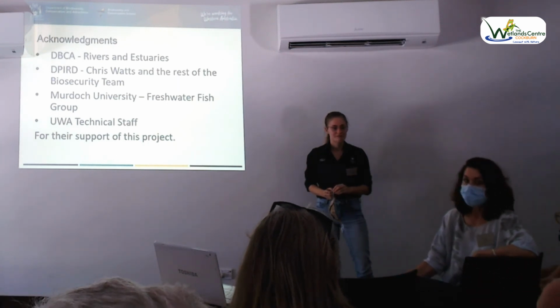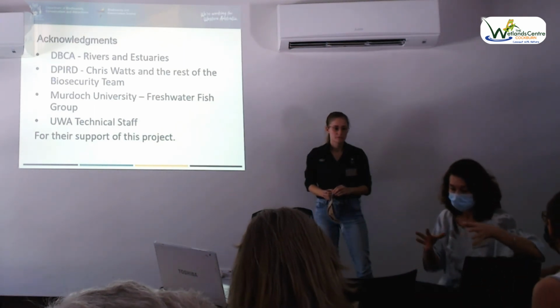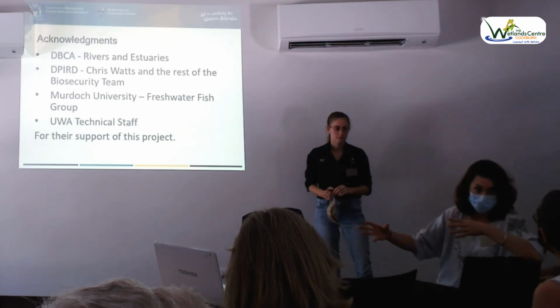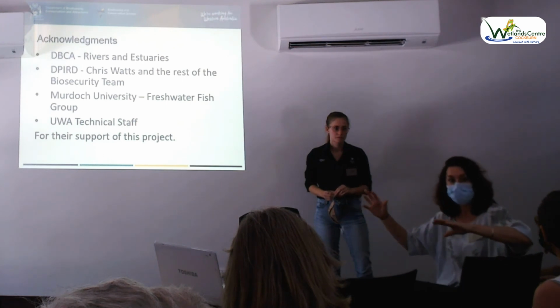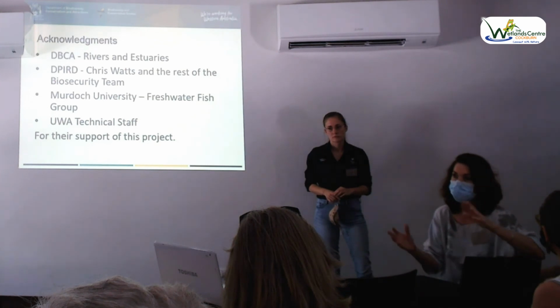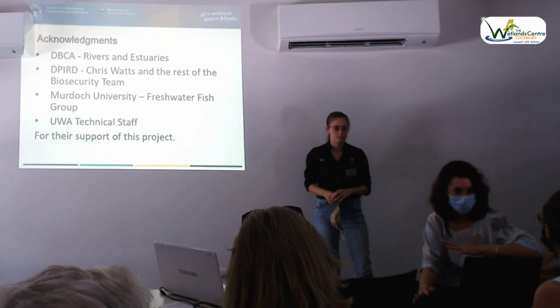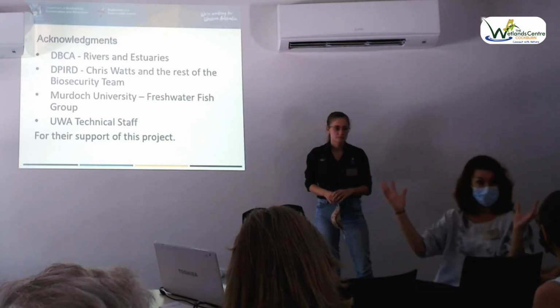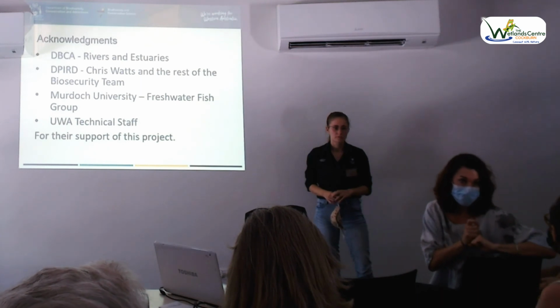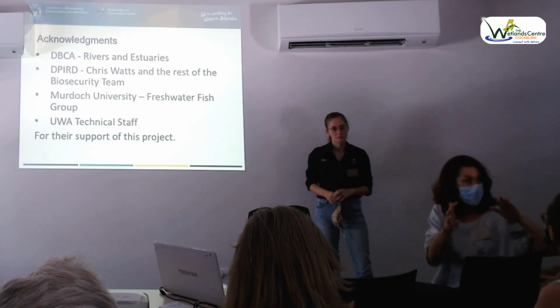Really good question. And there's definitely economy of scale as well, because whether you're taking a batch of 10 samples through the lab or 100 samples, there's really not a big time difference. There are consumables and all of that, but the amount of time to put in is similar. And then it really depends on the depth of sequencing you want from those samples and what it is you're asking about. Do you want a biodiversity survey, or are you only interested in looking for that one really critically endangered species, and does it occur there? So there can be some differences.